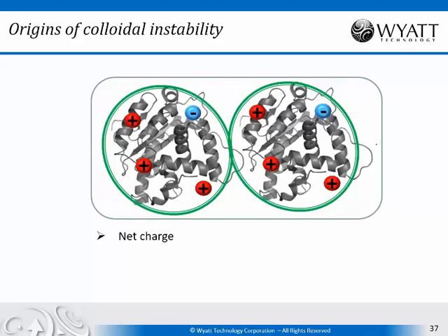And if the molecules have a net charge, which is the same sign, they will repel each other. So these two molecules each have a net charge of +2, and therefore in solution they'll repel each other due to that net charge. In particular, if they're relatively far away from each other, primarily the interaction that they'll see will be that charge-charge interaction, and it will be repulsive.